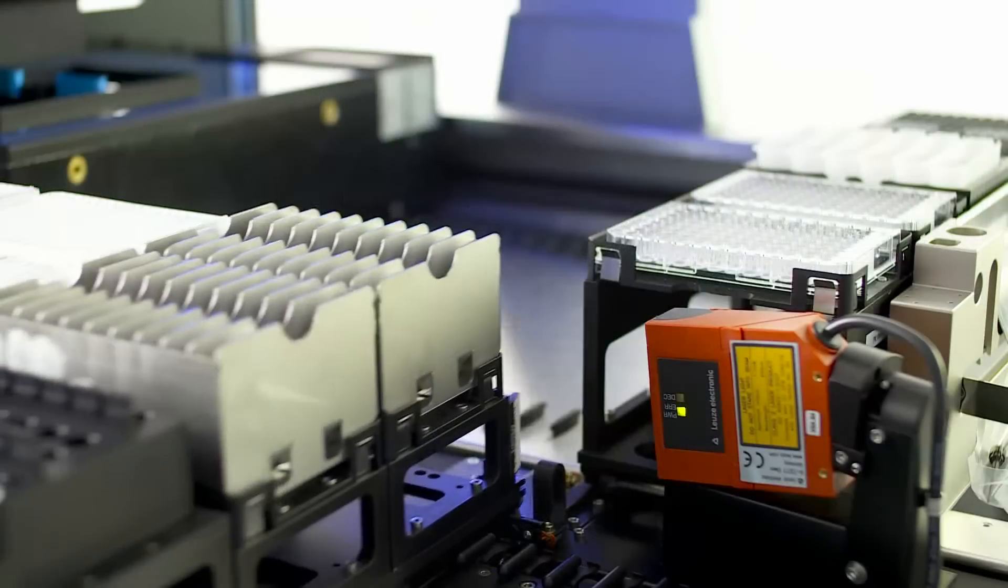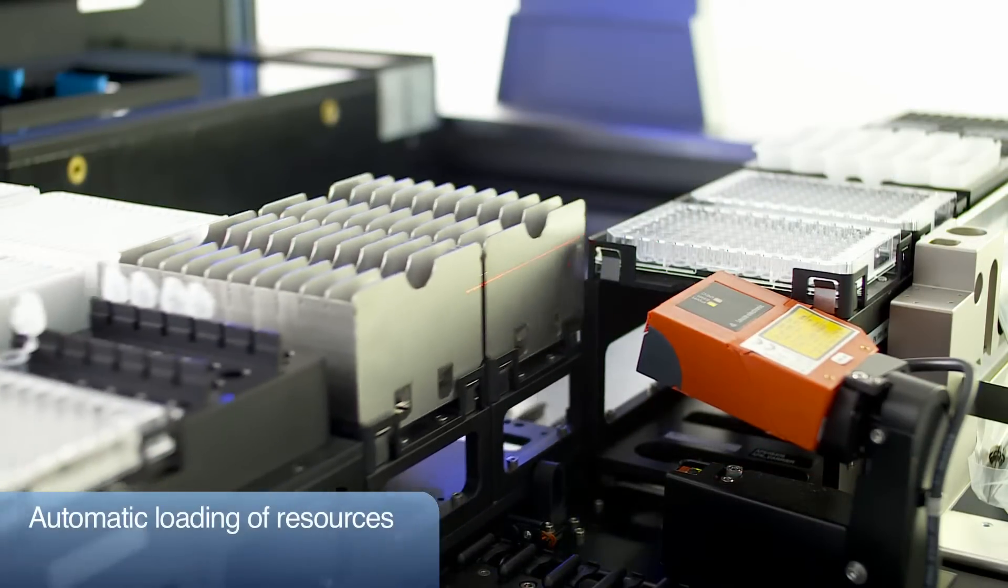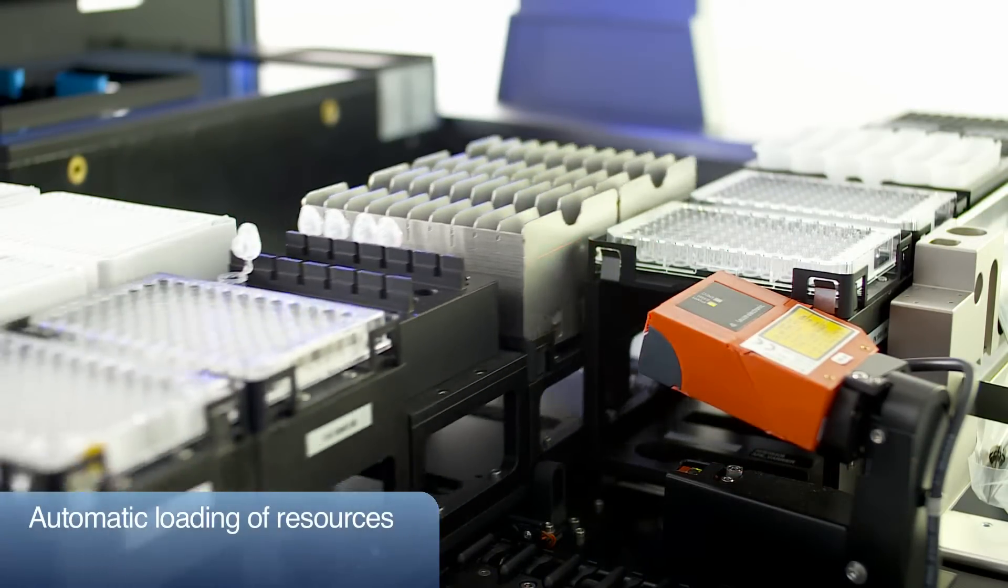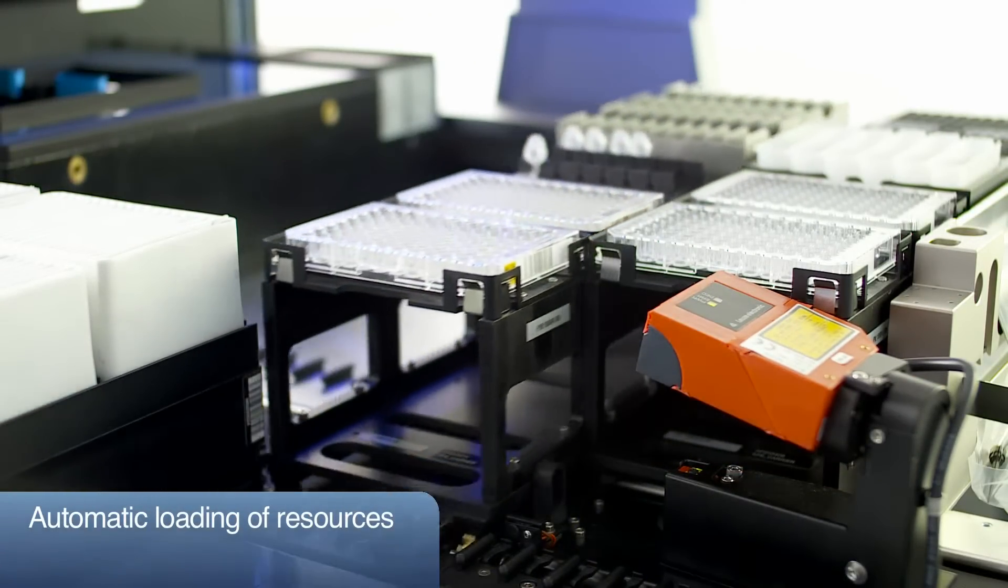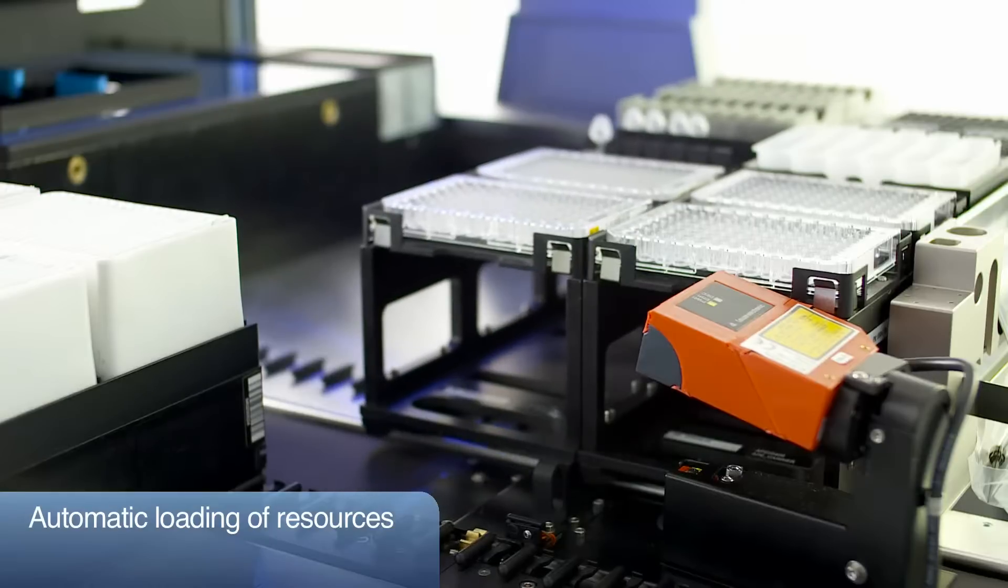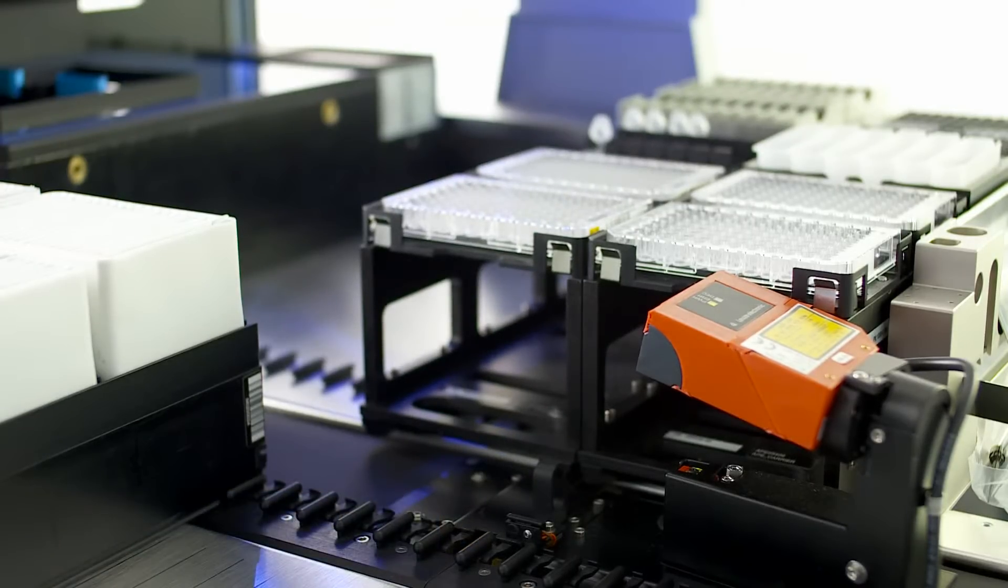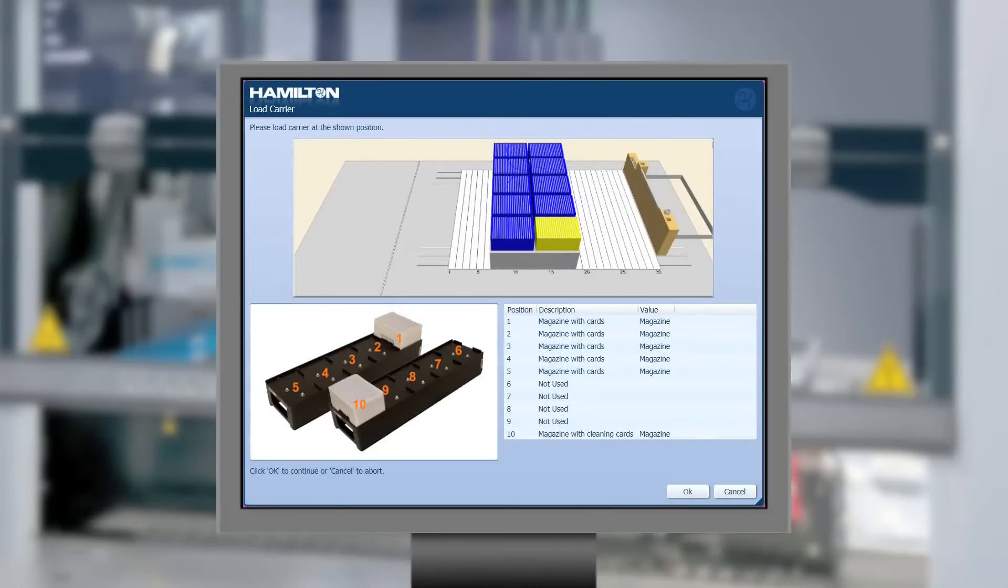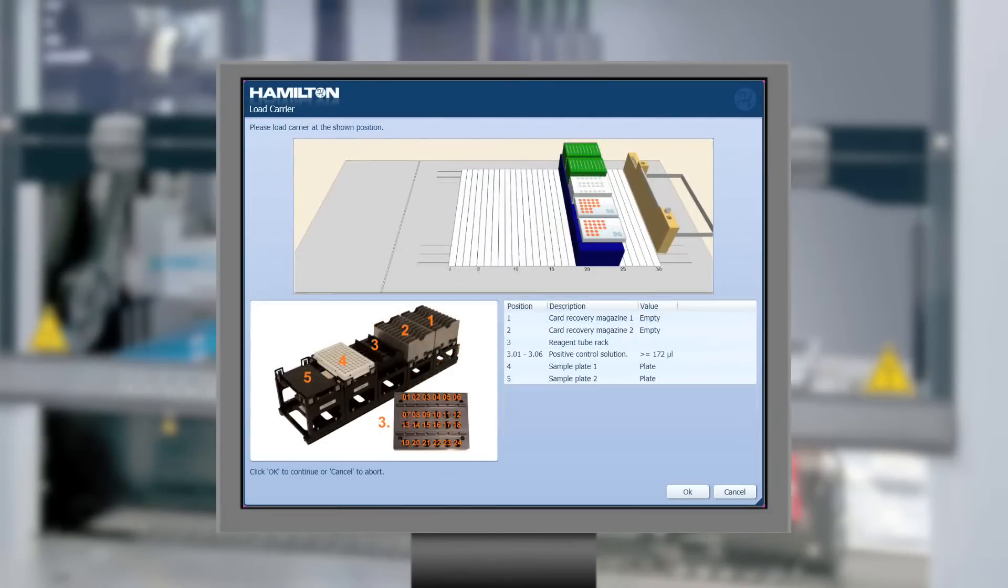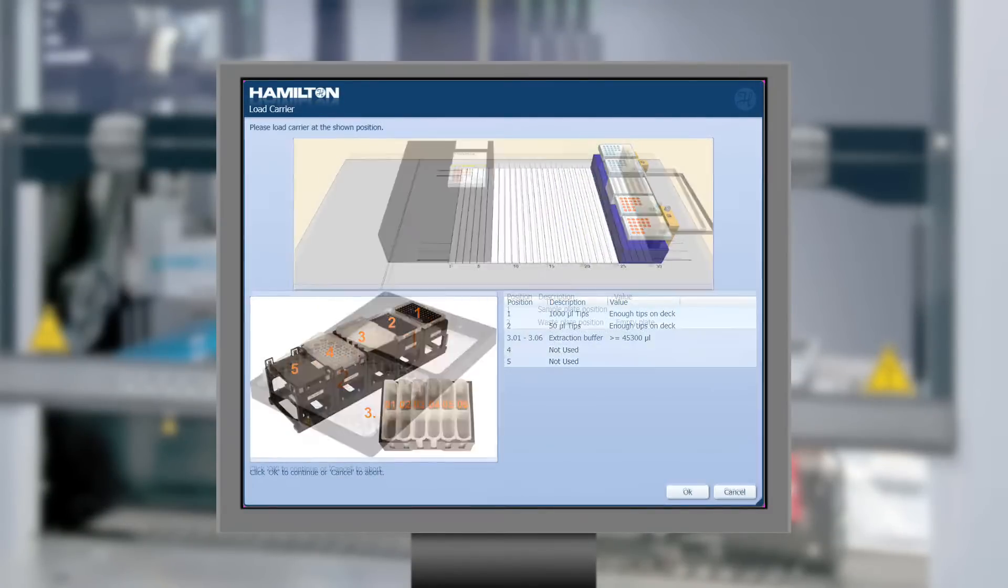The system supports automated loading of multiple resources required on the deck, such as magazines holding the sample cards, plates, tips, and reagents. An interactive dialogue confirms that each resource is loaded to the right position.